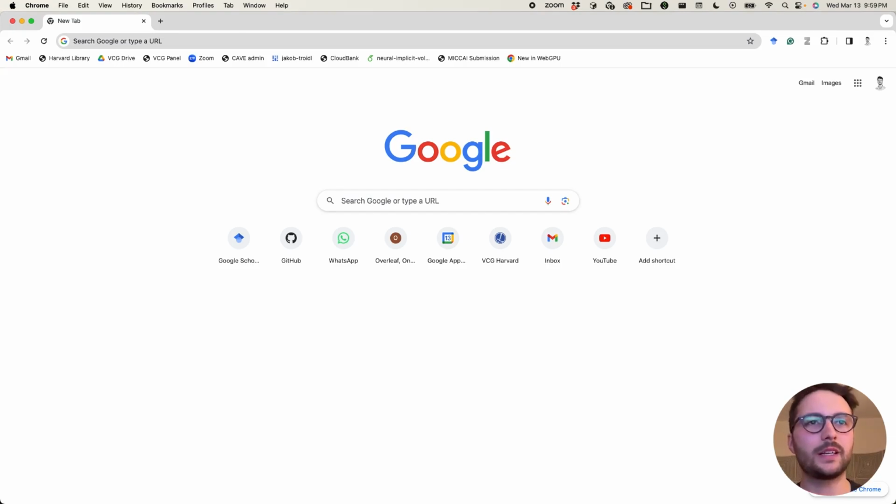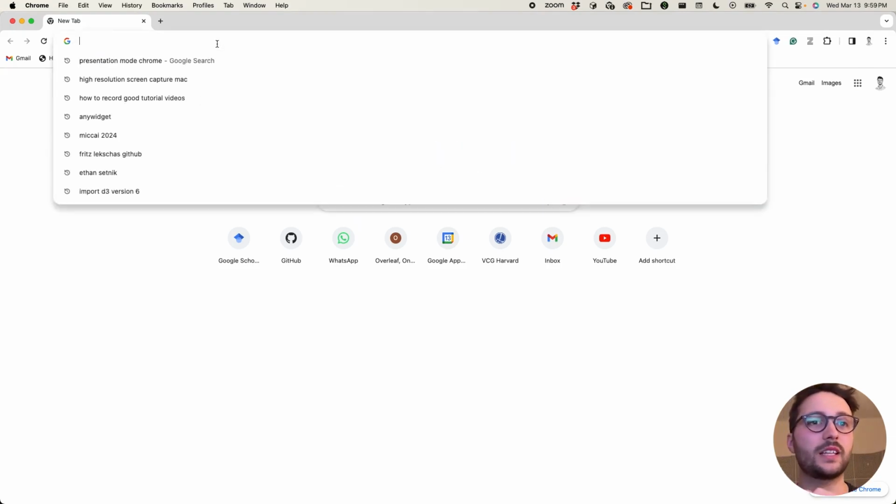Hi, my name is Jakob, and I want to show you how to proofread the H01 dataset using Cave.